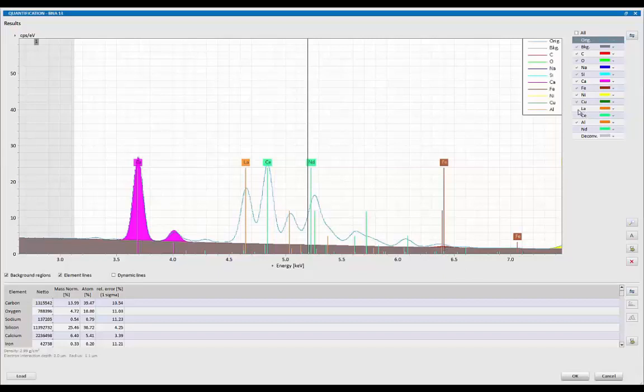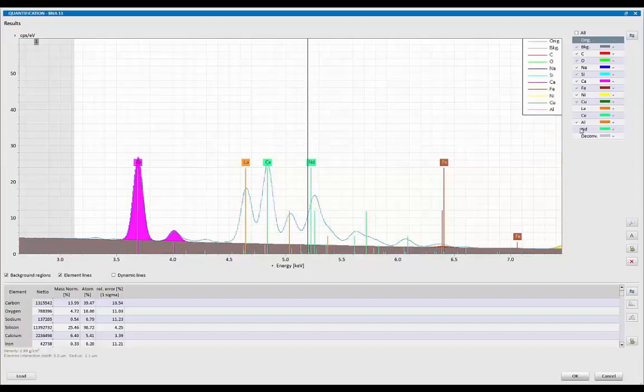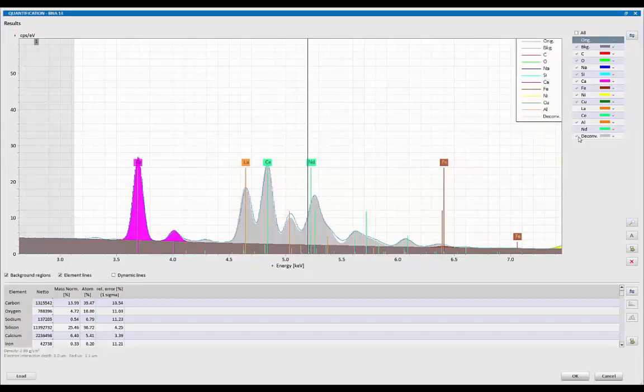I can now tell the system, show me lanthanum's contribution. So that's lanthanum's contribution by itself. Now show me cerium and neodymium. And if I hit decon, it shows me the sum of all that. And overall, that looks pretty good, except for this one region over here.